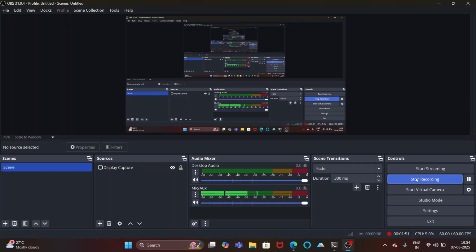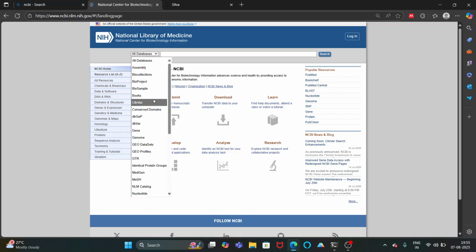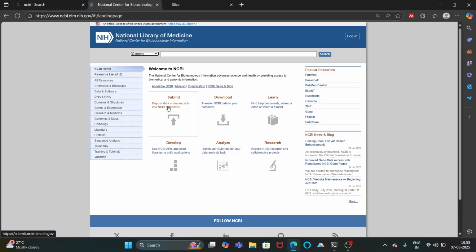But in this video lecture we will be removing the human genome sequences, the rat genome, and also the RNA sequences or ribosomal RNA sequences that may be present within the FastQ file for the Pseudomonas. So first I need to download the genome sequences, right? This is the NCBI database. I will click here on genome, select the genome and type in human.